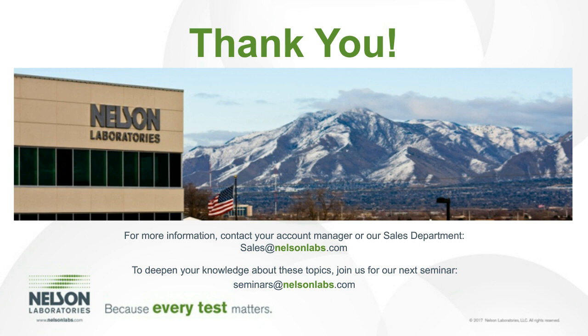And it's been difficult to set because there are so many different types of devices out there, and materials and processing, and it really comes down to, for me, what your device is and the intended patient contact and duration. And so here at Nelson Labs, we've been recommending people go more the ISO 10993-17 route, where you try to specifically identify and quantify the residuals that are left behind in your device and then do a risk assessment if that were to come in contact with the patient for that specific route of administration and duration.